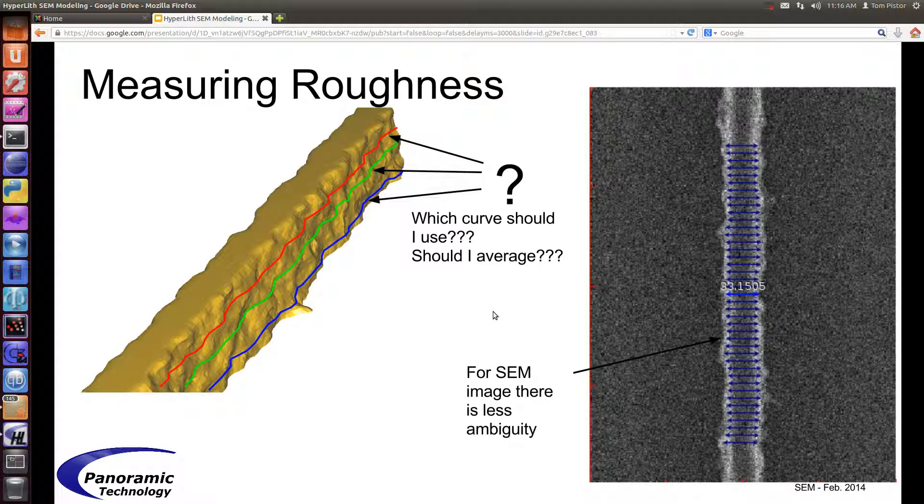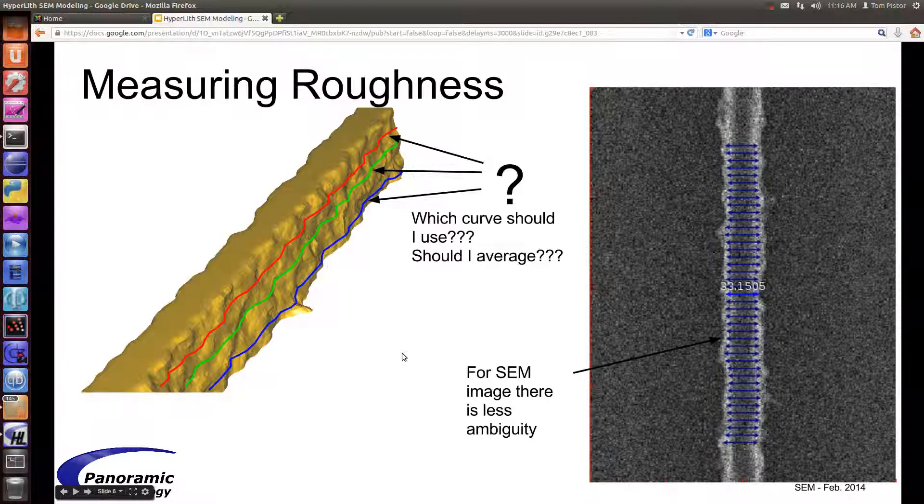You have a SEM measurement algorithm that gives you a CD at several places, and then you take the stochastic analysis of those various CDs. So if you're going to compare roughness of simulated resist profiles, you should really compare the roughness of simulated SEM profiles to actual SEM profiles.